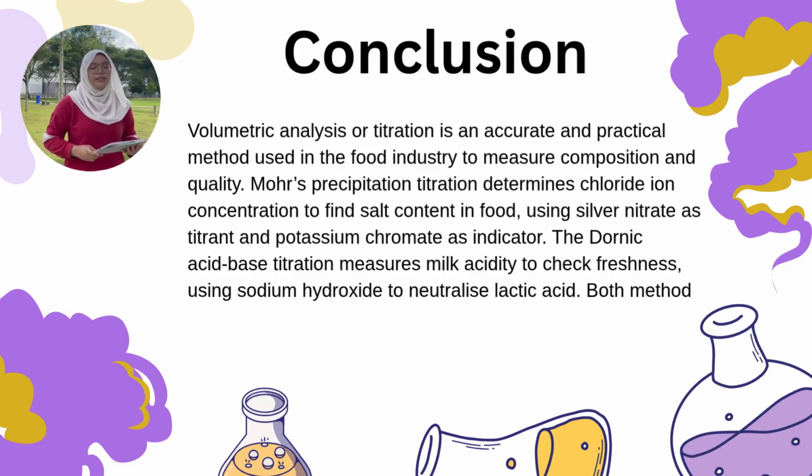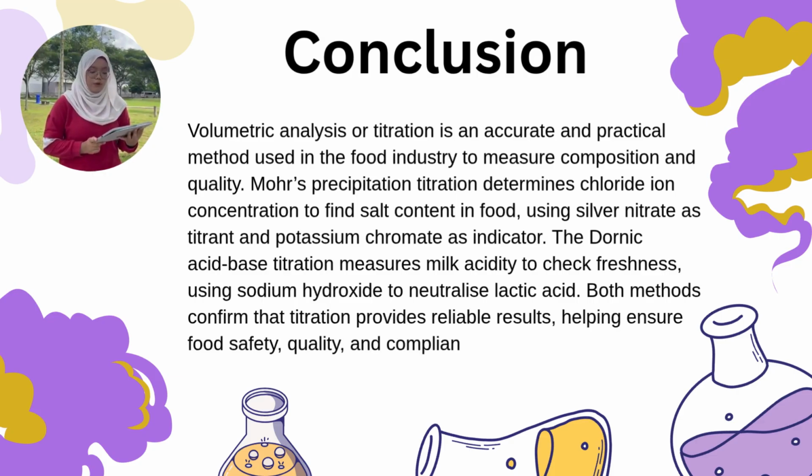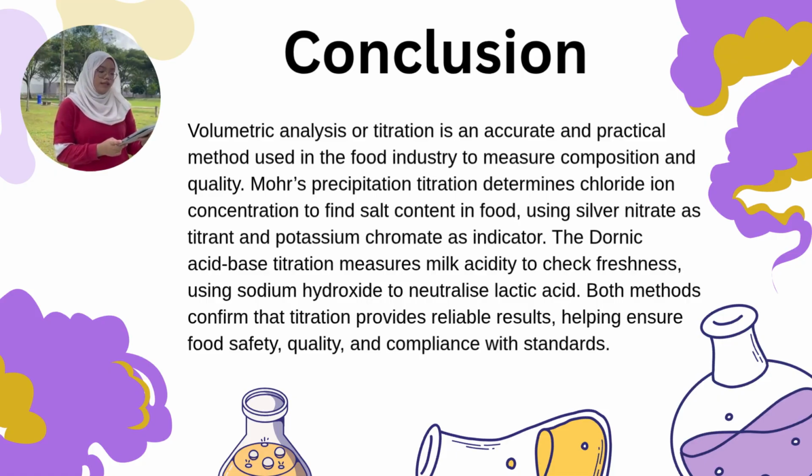Overall, both methods show that titration is an effective technique for ensuring food safety, maintaining product quality, and also meeting industry standards.